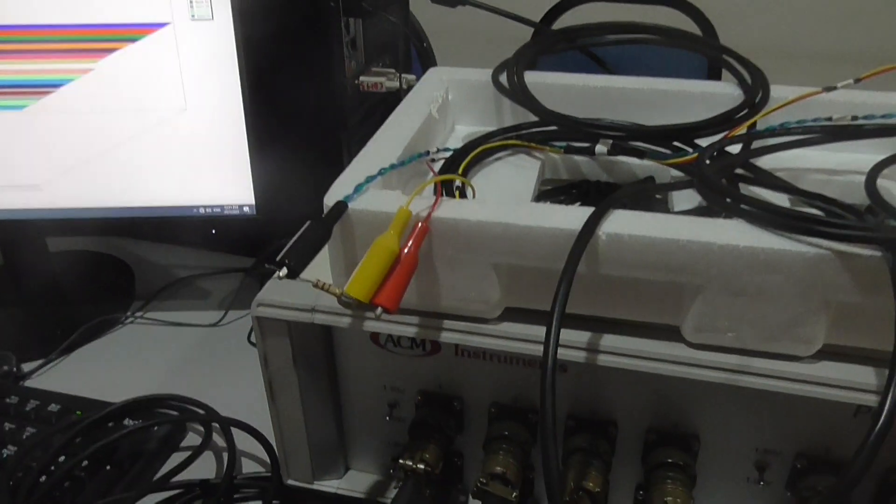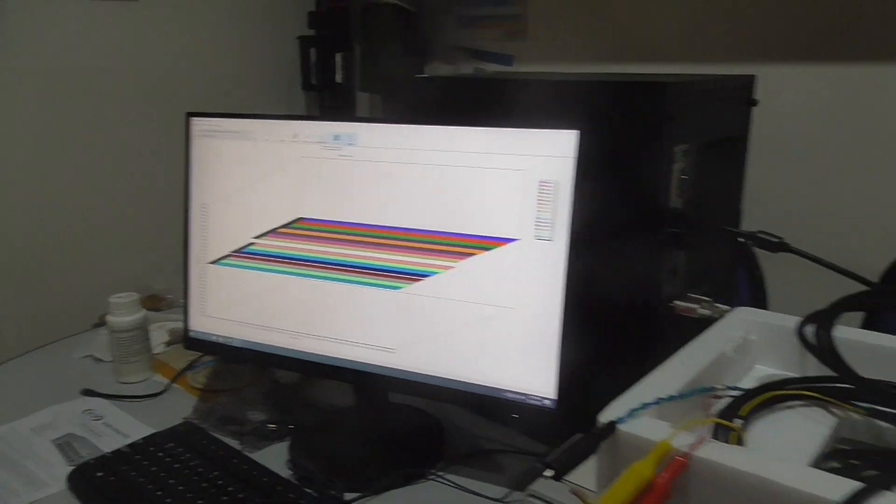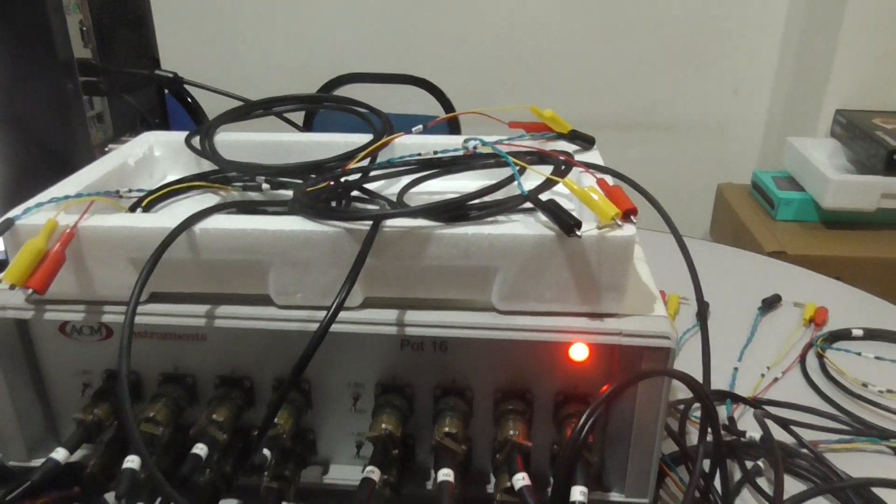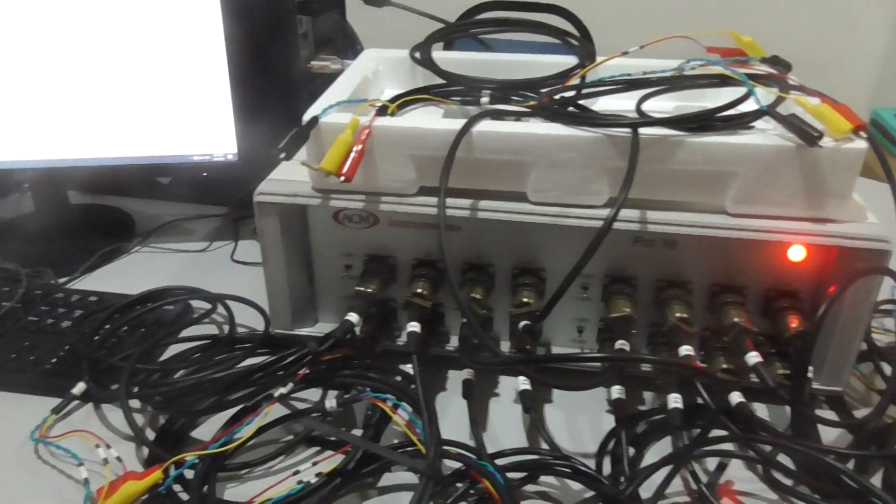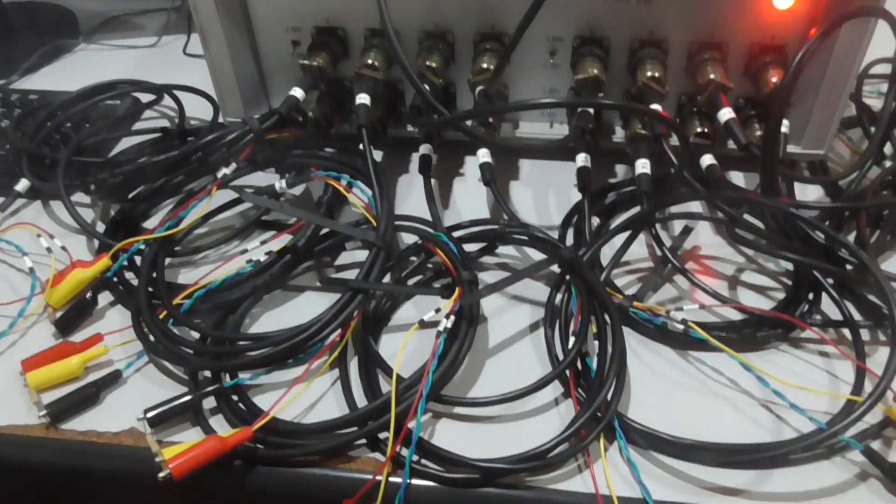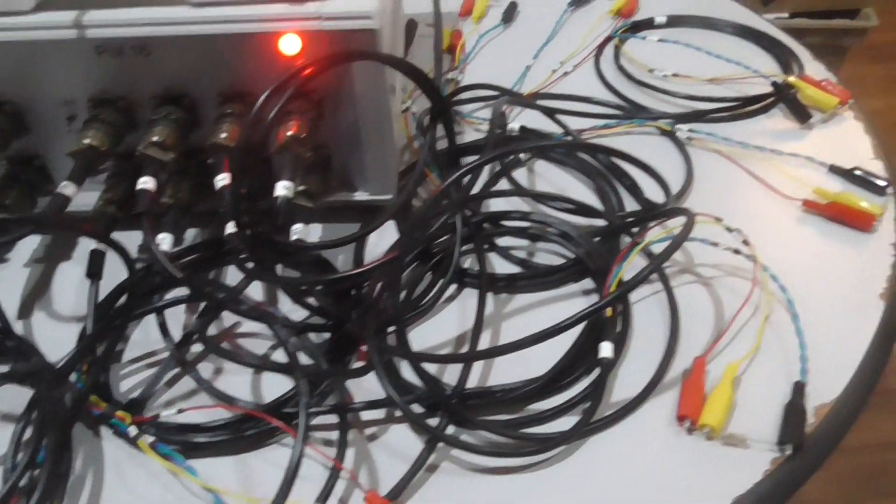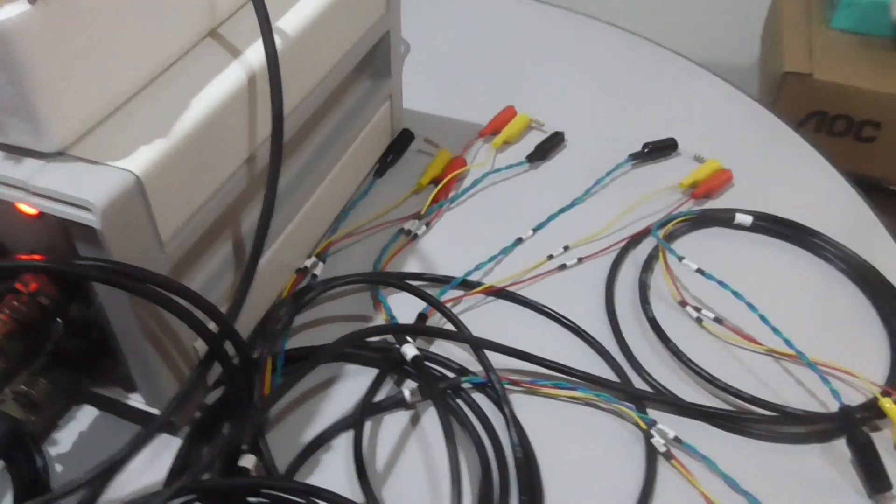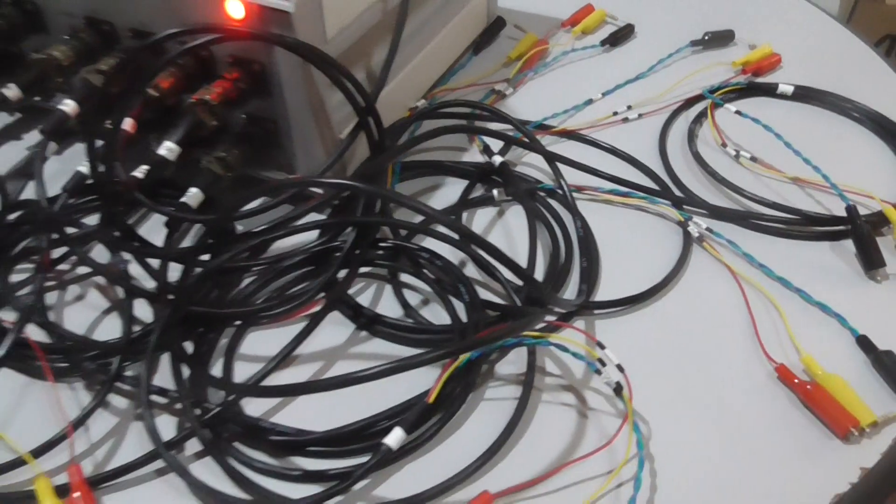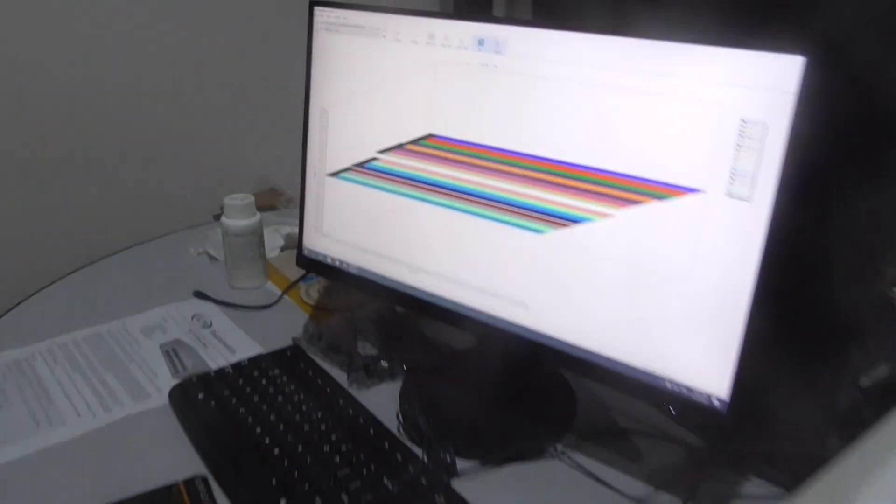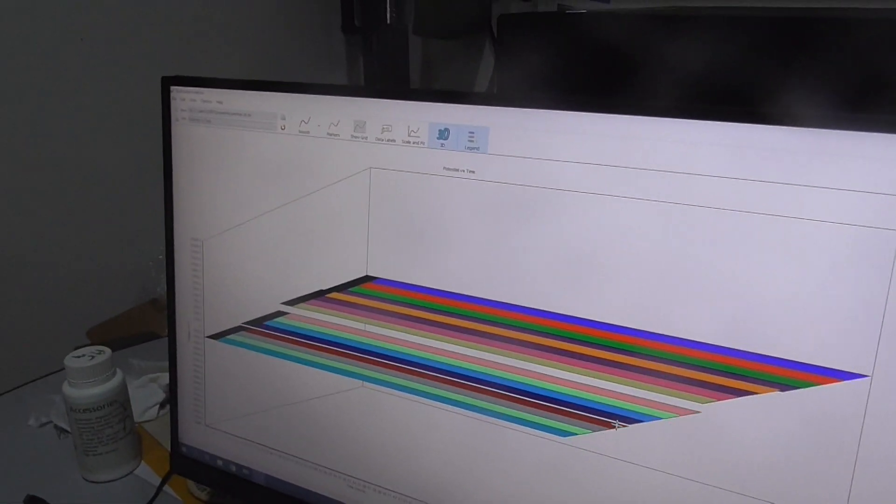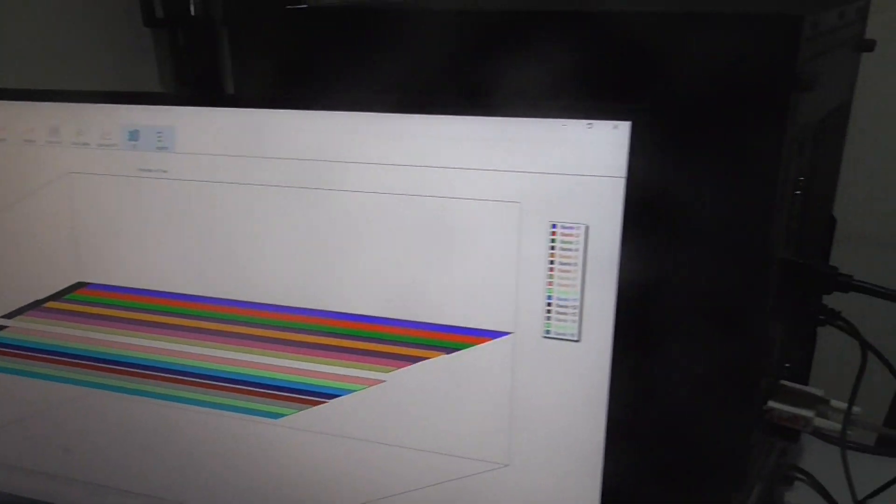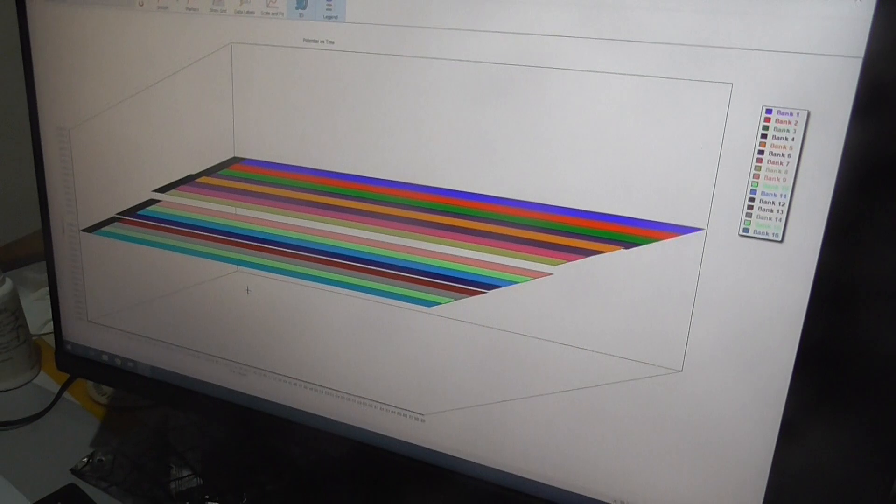That's how it works. Much easy. And then this is a normal standard scale. It's overlapping one to another so you can't see much. But it's actually showing that, it's the best you can see here. You can see how it reads and you also can print the data.